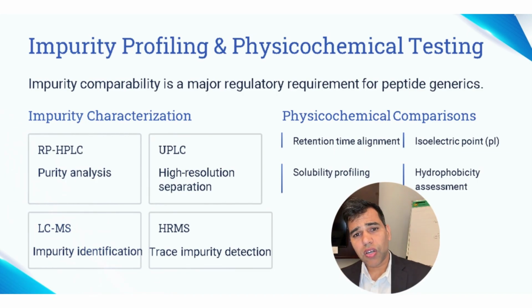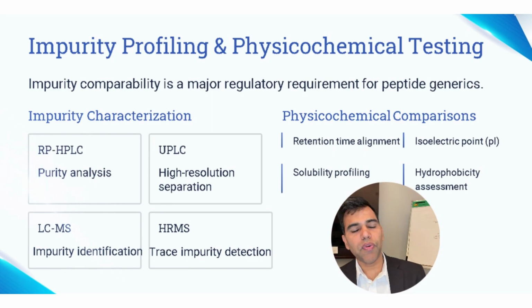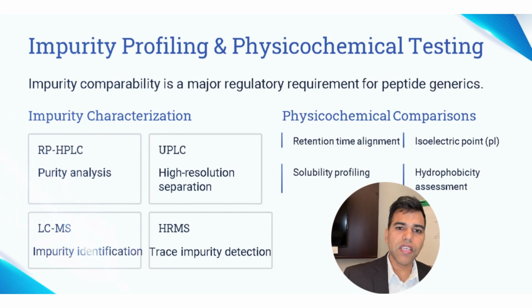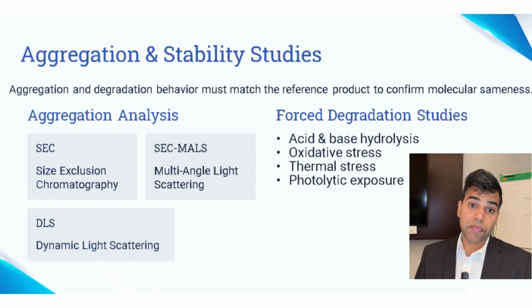Beyond purity, you are also doing physicochemical comparisons: retention time alignment, isoelectric point, hydrophobicity profiling, etc. These aren't just box-checking exercises, they are part of painting a complete picture of a molecular sequence. Aggregation and stability, proving the sameness over time.